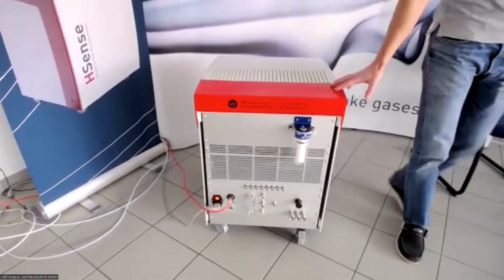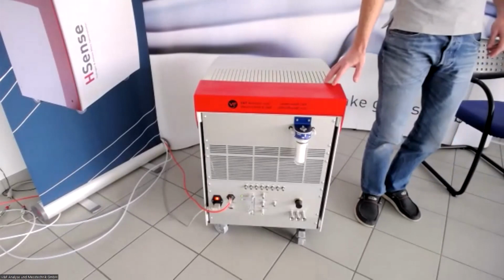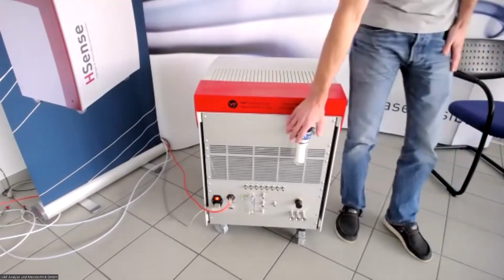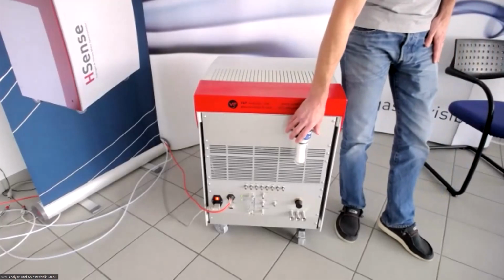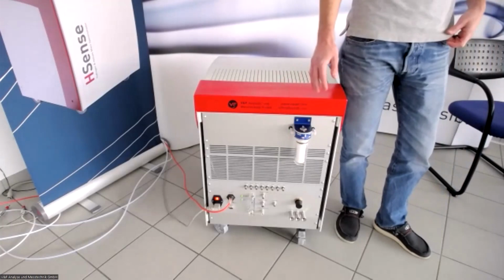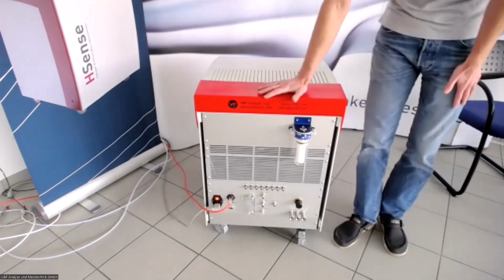This instrument is an internal combustion engine type of HSense. This is usually for us immediately to be seen because we have here this big filter unit that we have seen before in the schematic presentation. So as you see, this instrument is already running.